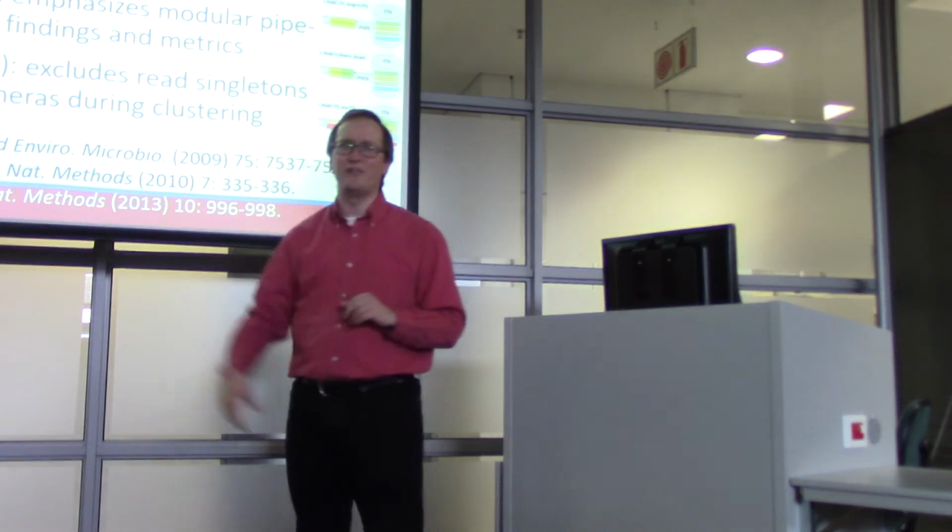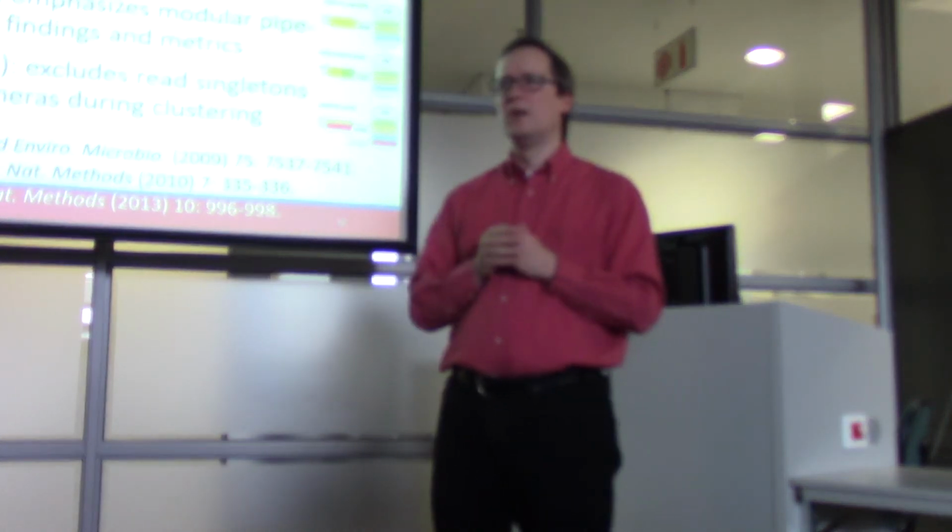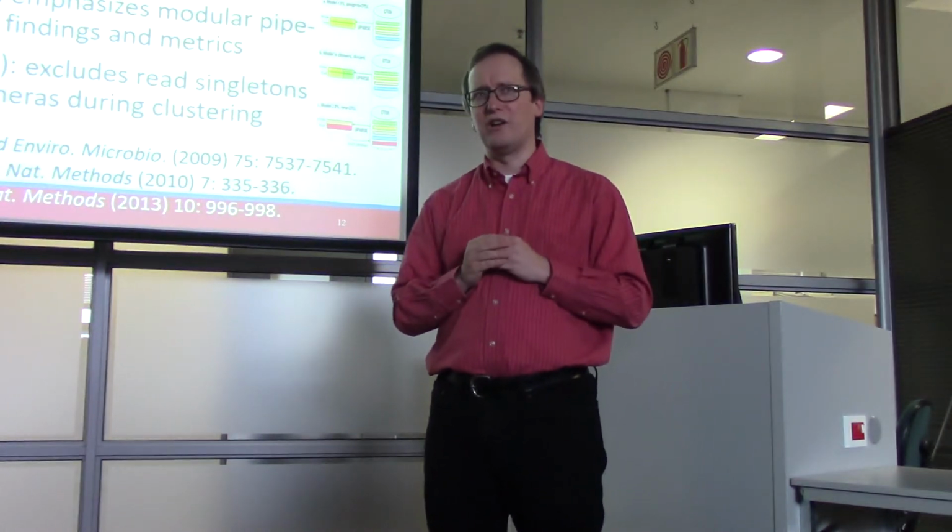The next is the problem of chimeras. Chimeras. What is a chimera and why are we concerned about it?